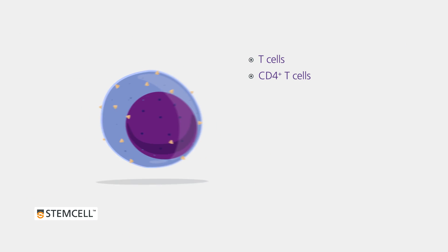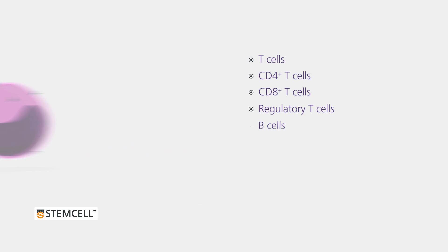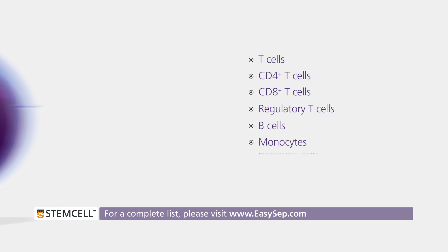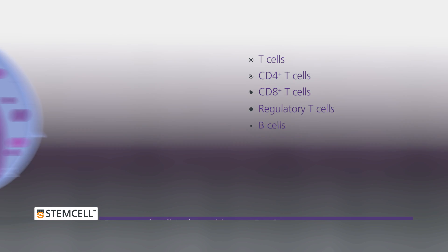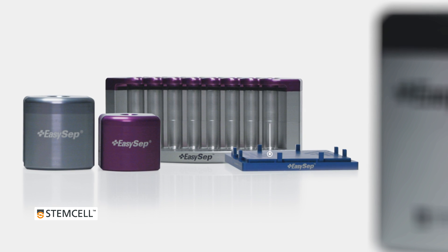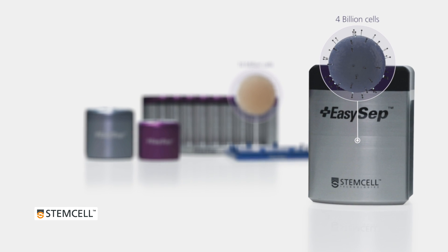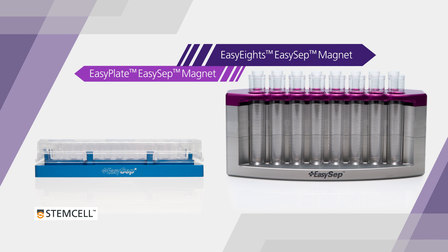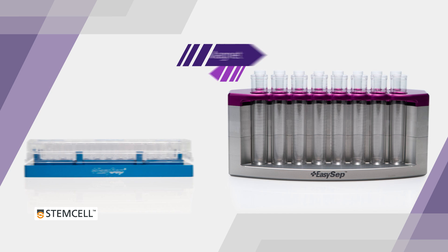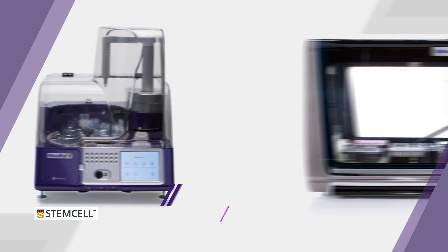EZSEP isolates a wide range of cell types from a variety of sample sources with high purity and recovery. For a complete list of cell types, please visit EZSEP.com. Use EZSEP to isolate cells from samples containing as few as 10 million or as many as 4 billion cells. Isolate multiple samples at once using either the EZP or EZ8's EZSEP magnets, or automate your cell isolations with RoboSep S and RoboSep 16 to minimize sample handling and hands-on time.